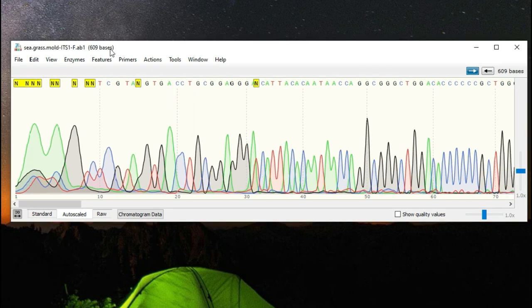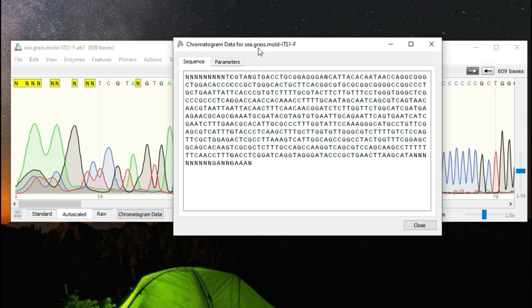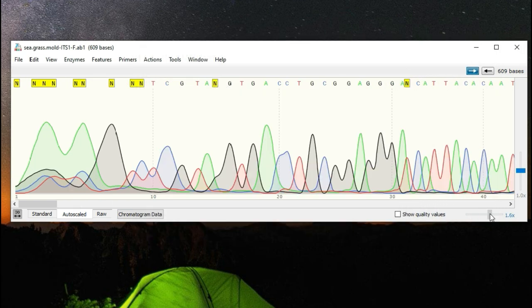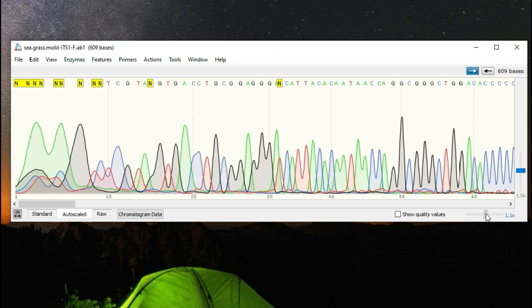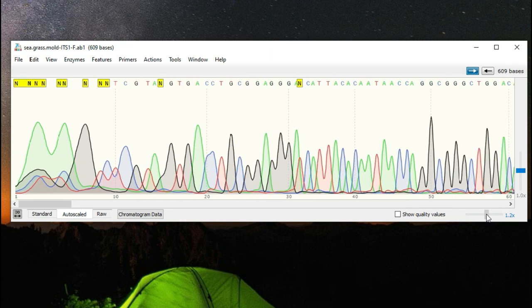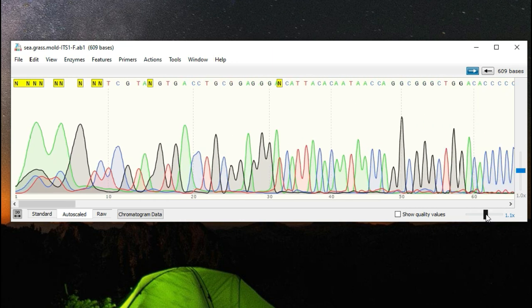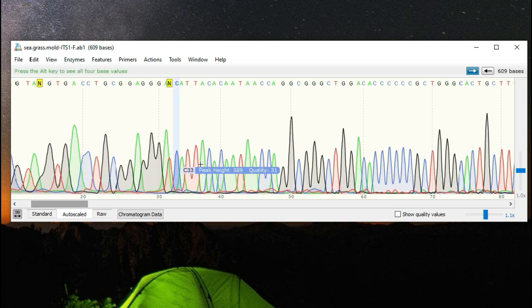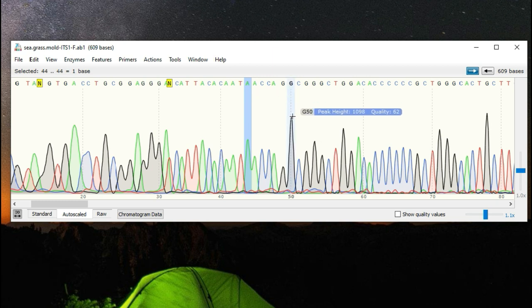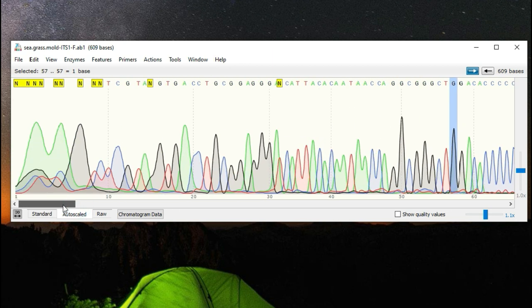So let's take a quick tour of this chromatogram in the snapgene software. We'll see in the title it says there were 609 bases and if we click on chromatogram data we'll see what looks like the FASTA format which is the raw sequencing bases. There's a couple of handlebars that you can use to zoom in or just make the graph a little bit more readable.